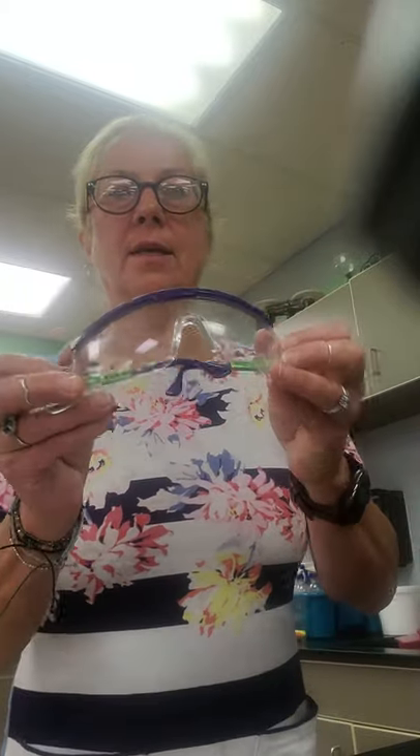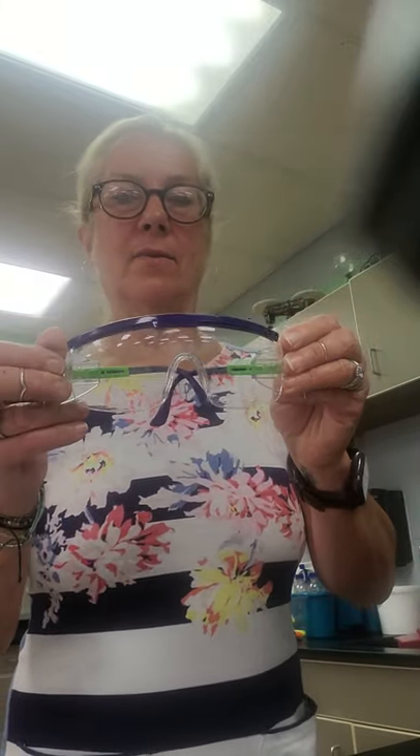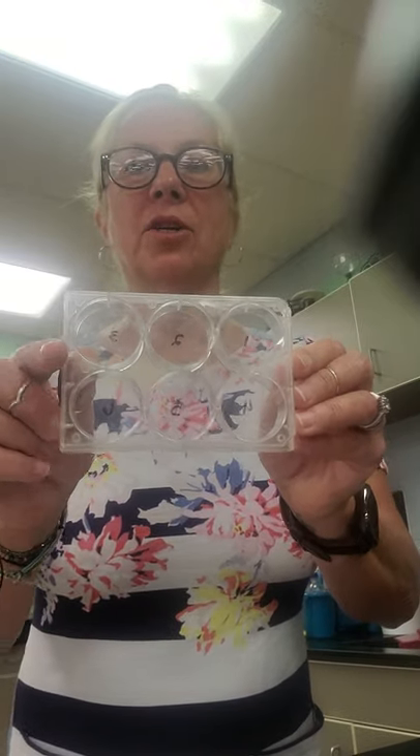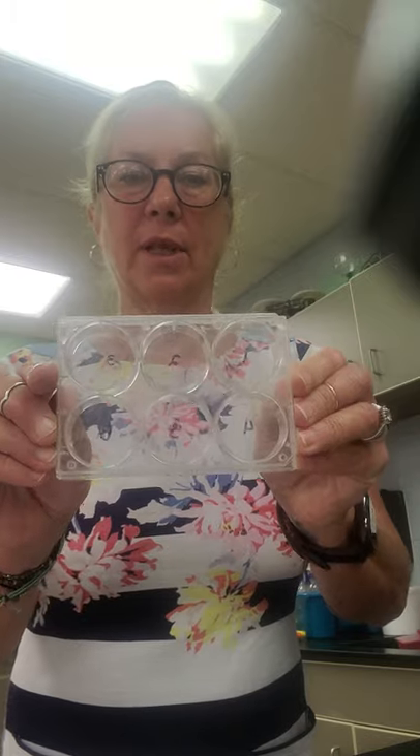Number one: use these to protect your eyes — safety glasses. Number two: when doing small reactions, this works very well; you could perform six reactions. Number two is reaction plate.